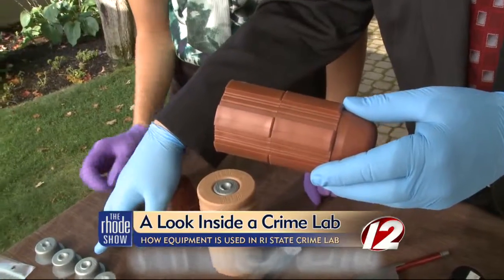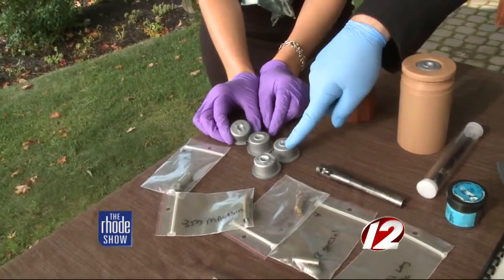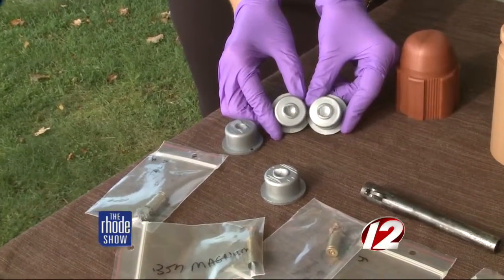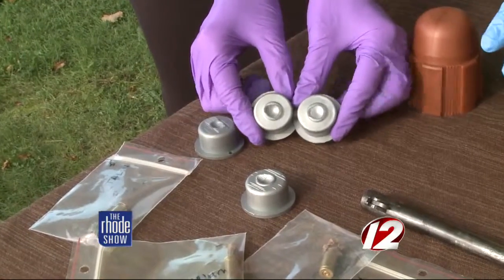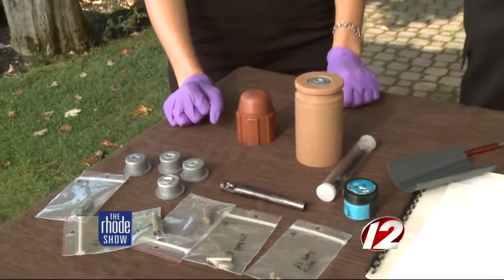Here you see three different types of firing pin impressions, and I'm looking to pick out the two that match. So these two match — that's what they would be looking at under a microscope to match them, in order to say this cartridge case was fired from the same gun as the unknown, and this bullet was fired from the same gun as the unknown.